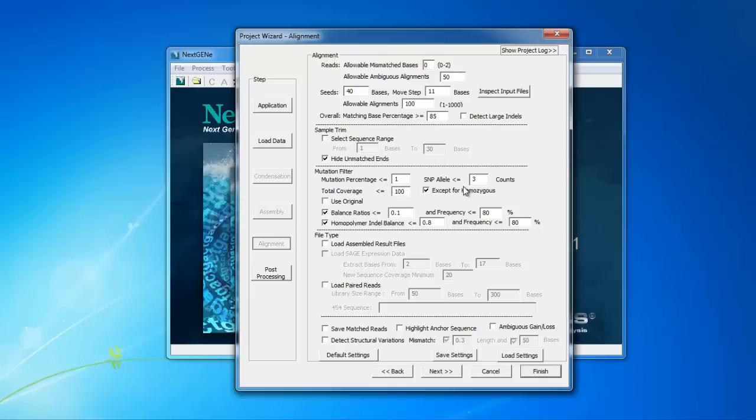The SNP allele setting is the requirement for the total number of reads with the variant for it to be called as a mutation. The default value is 3. For the cancer panel data, we'll also increase this value to 20.